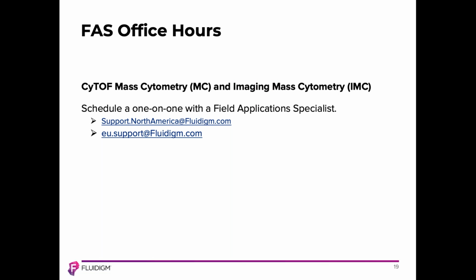So, I got another question: how can I address longitudinal comparisons in mass cytometry? This is a great question. Longitudinal comparisons are always a conundrum, no matter what cytometry workflow you're doing, whether it's flow cytometry, mass cytometry, or spectral flow cytometry, because batch effect exists in every staining procedure. However, mass cytometry has a couple of creative tools.